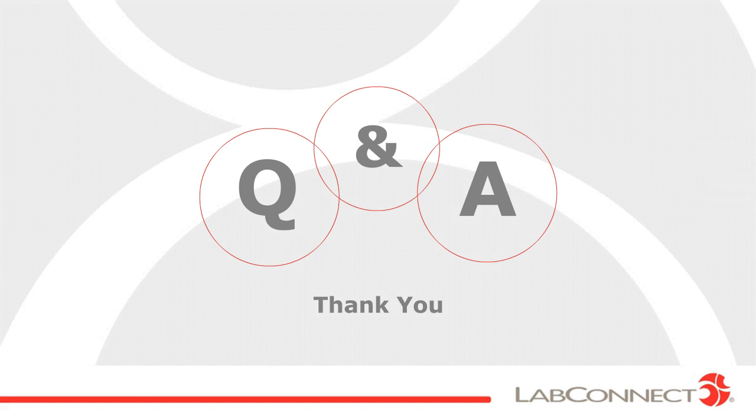Well, I'll take that one. I would honestly have to get you the exact QC process that they do, but they absolutely hand build the kit, and I know there is a review of that kit build by another person on that team.